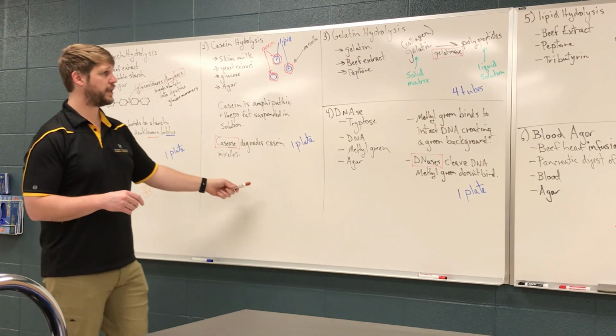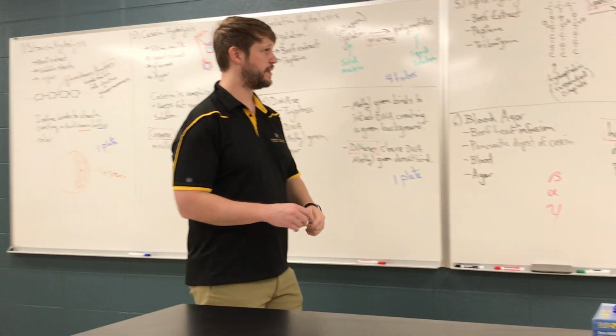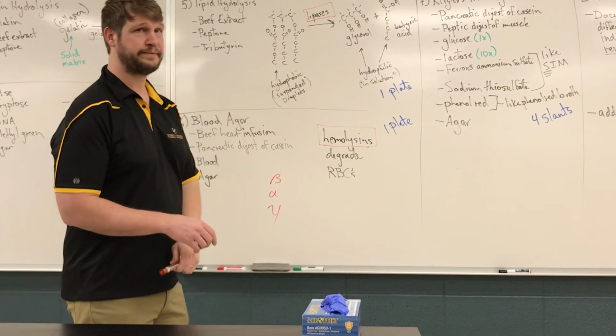So streak, streak, stab, streak, streak, streak.